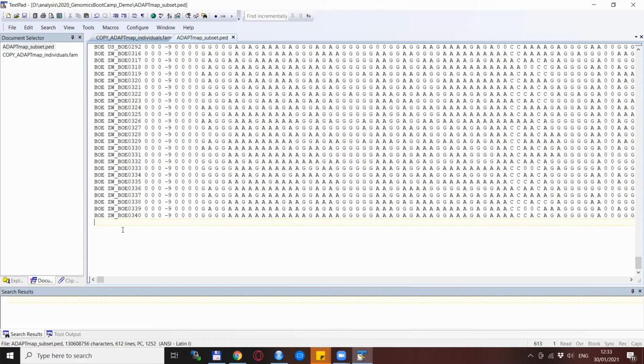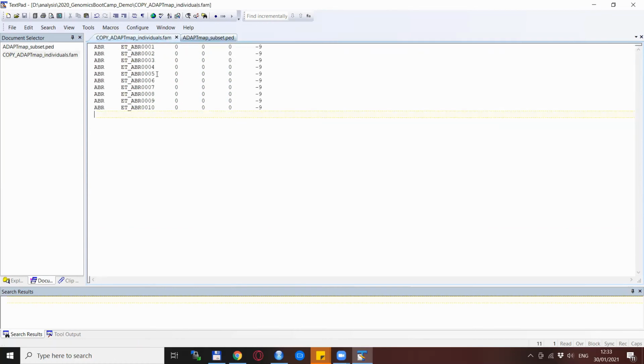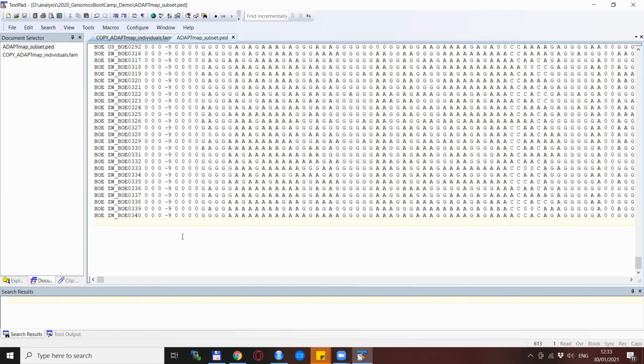If you want to try out the outcomes of these two methods, the slightly dangerous one and the very dangerous one, and their effect on the PCA plots that we were creating, I invite you to do so, of course purely for experimentation purposes. You will see what you have done and what the effects of these moves are. I also invite you to share your experiences regarding data extraction in the comments below the video. So this was it for extracting data with PLINK. You see, it was not really difficult.